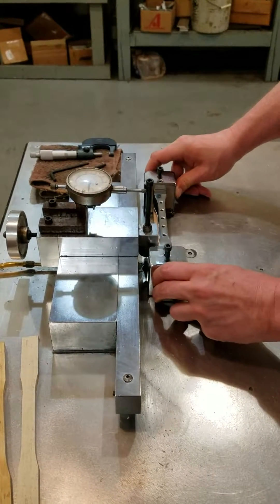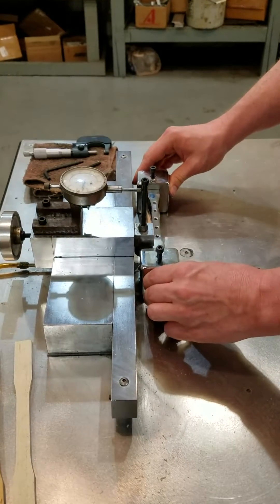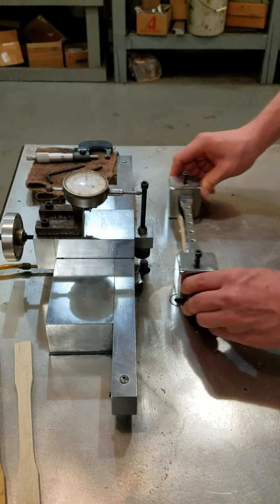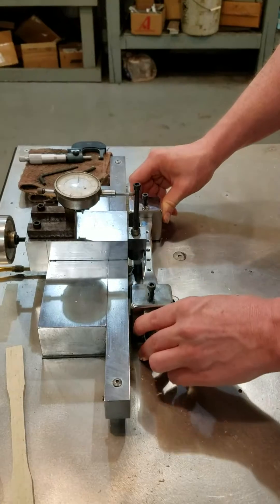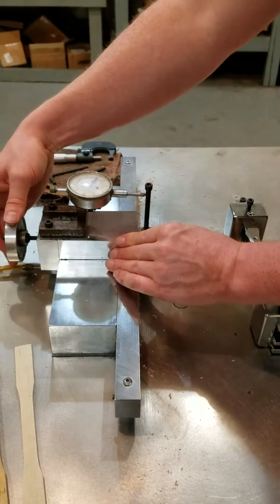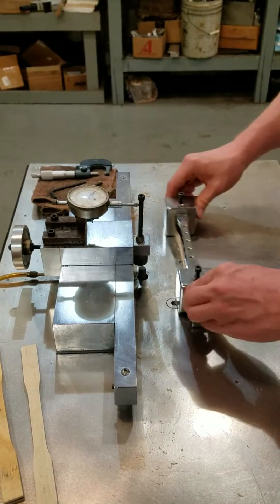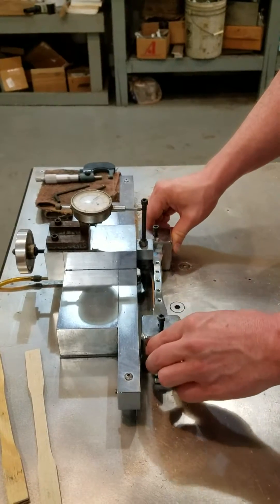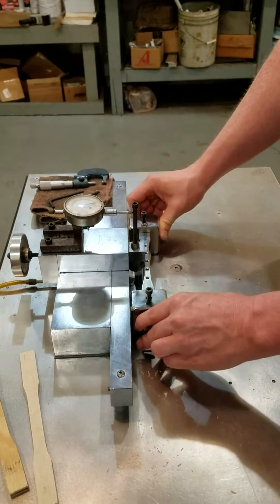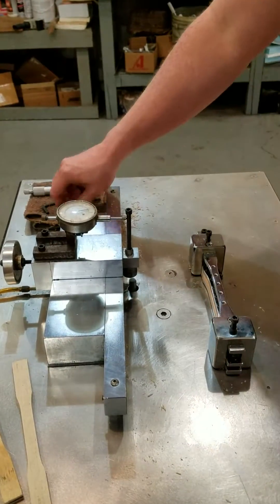So here we go. Those were at 50 thousandths pass, and those are our finished passes.